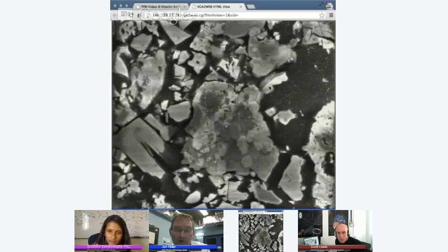Calcium is an insulator. So that's why this sample is in this microscope, because this is an environmental microscope. And I've had this thing running without being over in the lab to take care of it, and it just needs some adjusting.